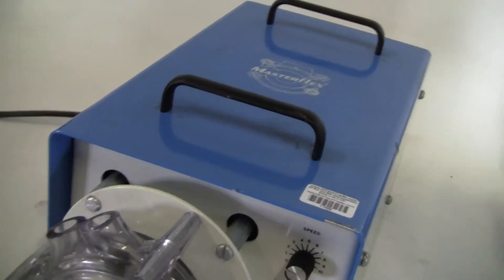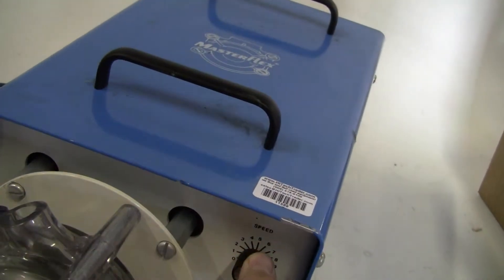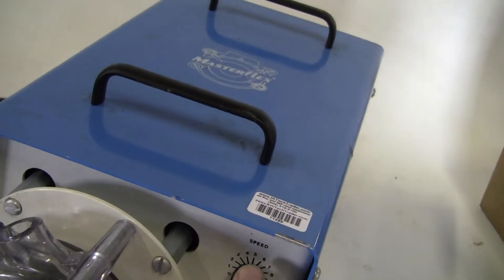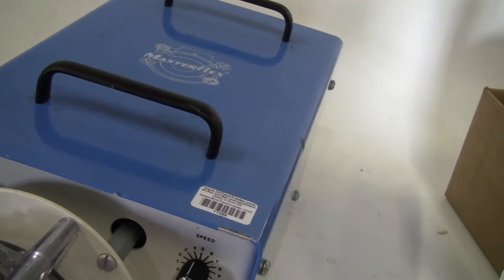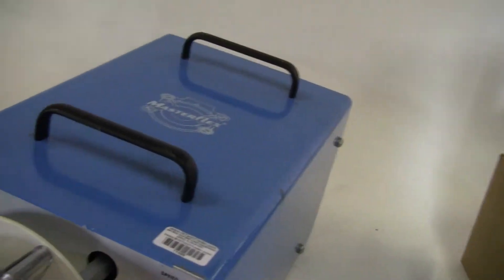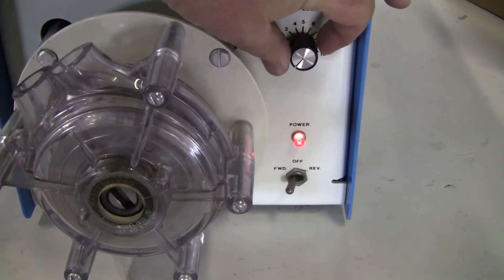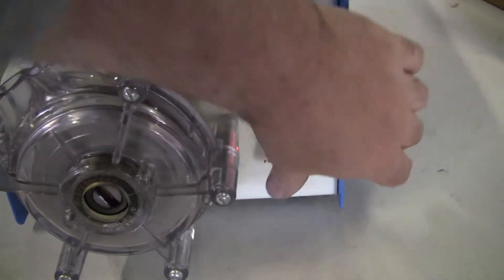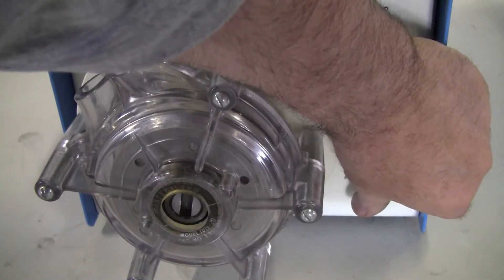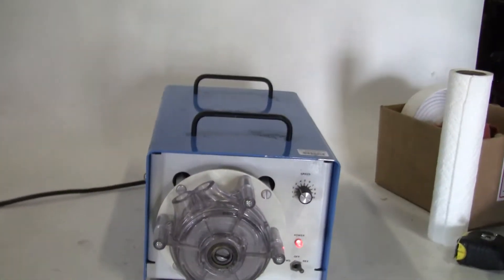So let's take a look at it. The variable speeds, going forward and reverse. Watch that again — I don't know if that made the camera the first time. See, it's working very nicely.